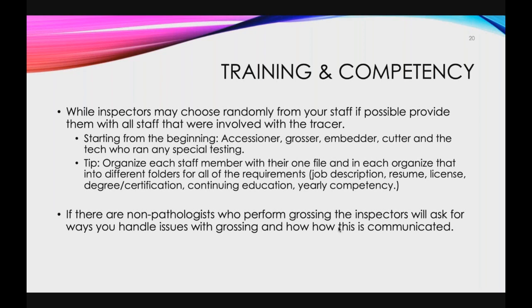Also, if there are non-pathologists who perform grossing, the inspectors will ask for the ways that you handle issues with grossing and how this is communicated with them. Whether you have a form, whether you have a spreadsheet, whatever it is, they will ask for that.